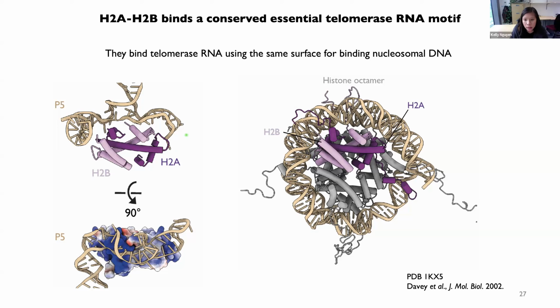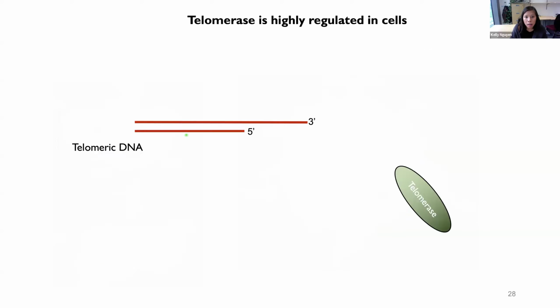Taking this a step further, having studied telomerase structure on its own, we also want to understand how it's regulated in cells. So using the same methodology we developed, we started to study telomerase regulation in the cell. And as I did not mention, most of the time in the cell, telomerase is not located at telomeres.